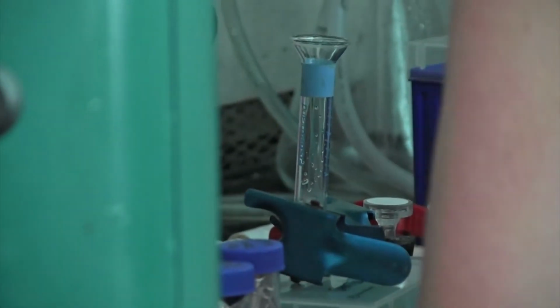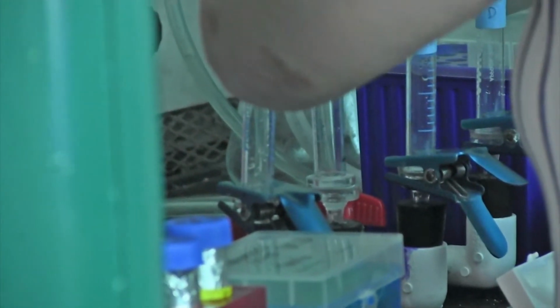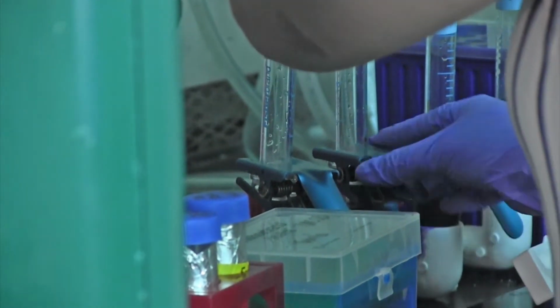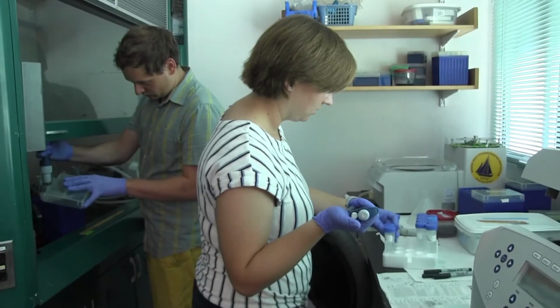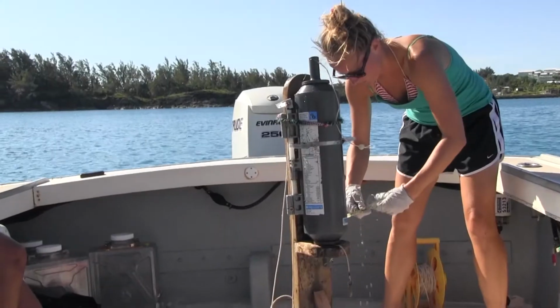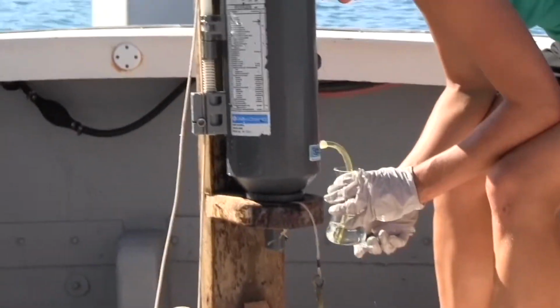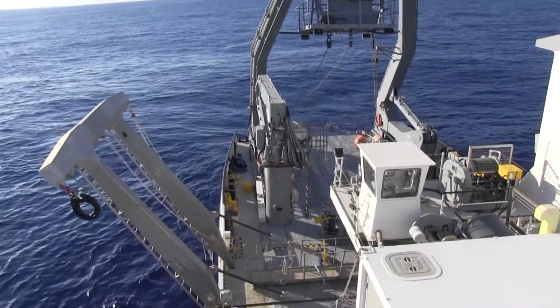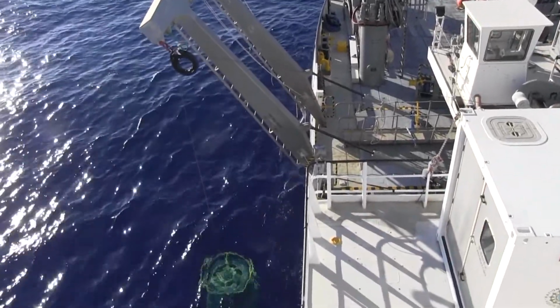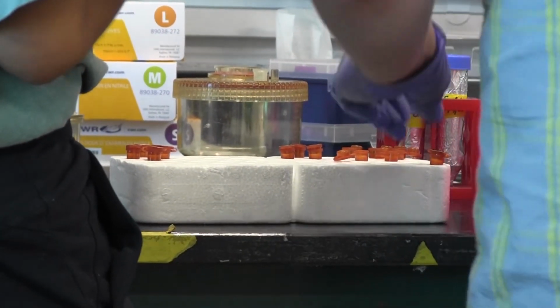So we put the backing filter on, the stained filter, we clasp the filter towers together, and then we filter anywhere from 1 mil to 40 mils. So for example, the Devil's Hole project, there's a lot of bacteria at 24 meters, so we back down to 1 mil. Whereas the bat site in the deep ocean, there's not very many bacteria, so we have to increase it to 40 mils.